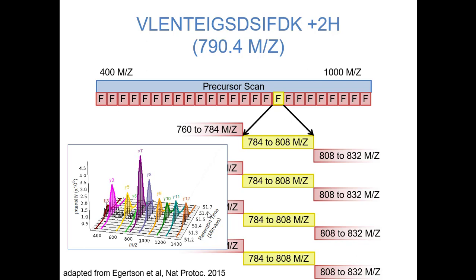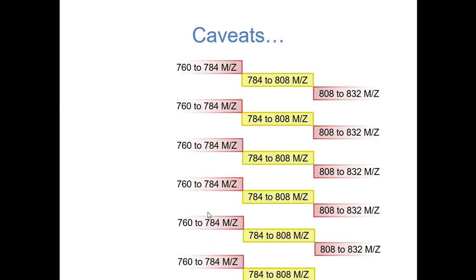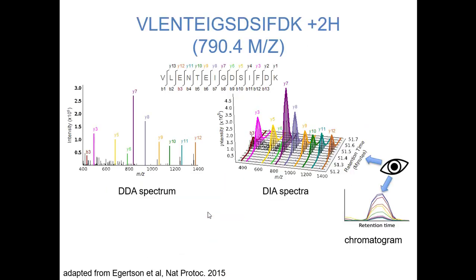Because of that, you can draw these chromatograms that you've been seeing as we've been looking at SRM data all week. So again, you get fragment ions that you would typically expect to see. This is what a DDA-like spectrum would look like for a single scan. Then basically we're trying to acquire repeated DIA scans and look at them down this axis to see the chromatogram.